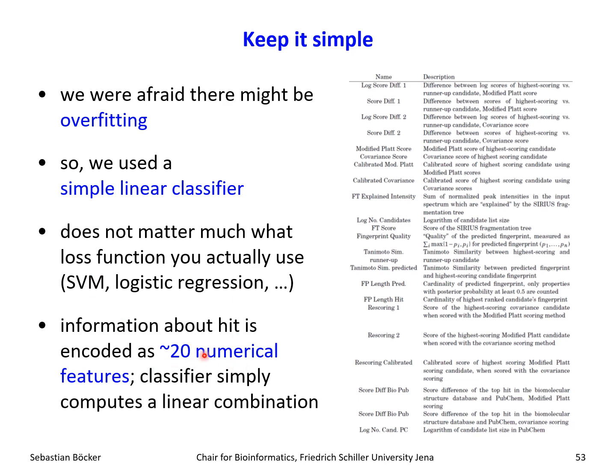And as I said, we now describe each hit by a few features, which you can find in the paper, like the score, the CSI FingerID score, score differences. We actually have 2 different scores now. We use both of them as features, but we also use the explained intensity. Are there many noise peaks, which we cannot explain in the spectrum? Then obviously the quality is lower, so it might be a bad spectrum. So we should reduce our confidence, or we might use fingerprint quality. We came up with a measure of if the fingerprint prediction is rather good or not so good, if it's unsure.